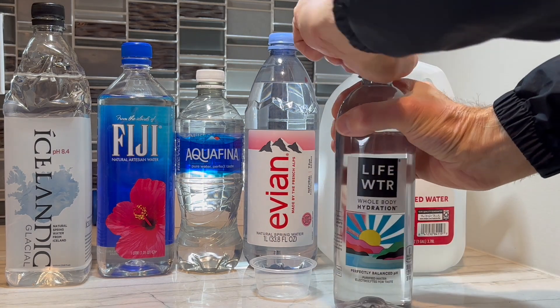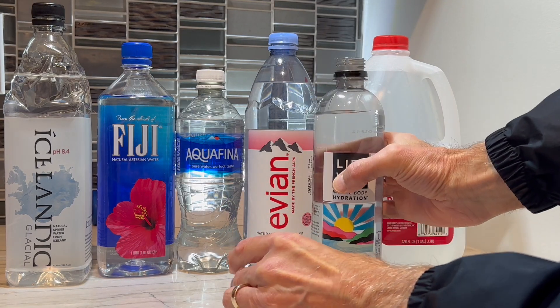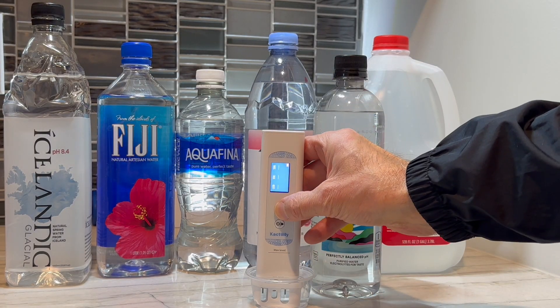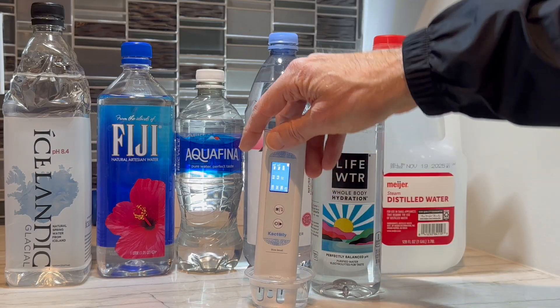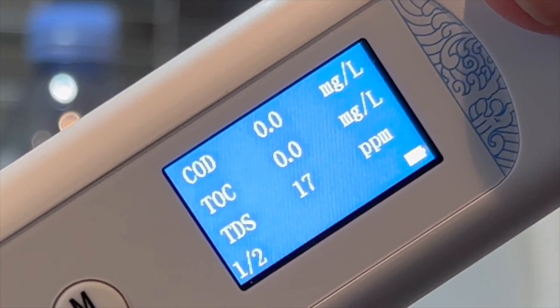We're finally going to test the Life Water. Like Aquafina, this is purified through reverse osmosis. In contrast to Aquafina, however, some minerals are added back after the purification process. Looks like TDS on this one measures 17 parts per million.